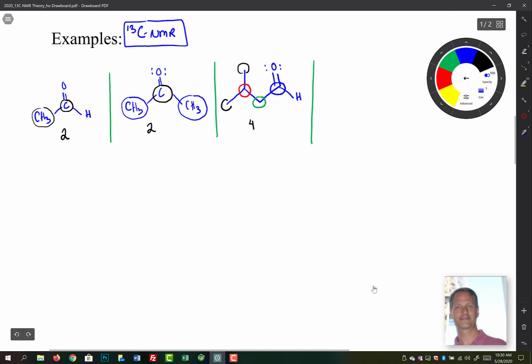All right, what about this? So let's put a benzene in here. And then on that, let's put, how about just one bond right there. Right, so counting this up, well, this is a peak. That's 1. Over here, here's 2. Now this carbon here, and this carbon here, and this carbon right here are equivalent. This carbon here and this one are equivalent, and then lastly we have this one. So counting this up, we have 1, 2, 3, 4, 5 peaks for that guy.